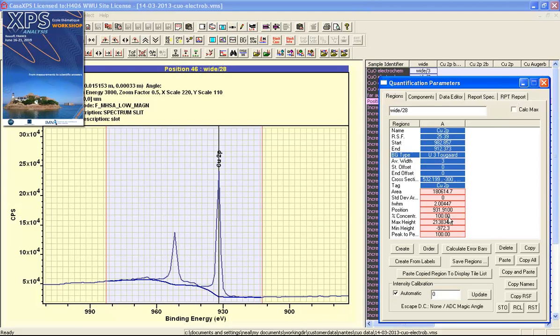There's also an atomic concentration calculation that's performed, which requires more than one region. Because we have a single region here, it's 100%. But if there were more regions involved on the survey spectrum, then the quantification that is calculated as regions are added will appear here.